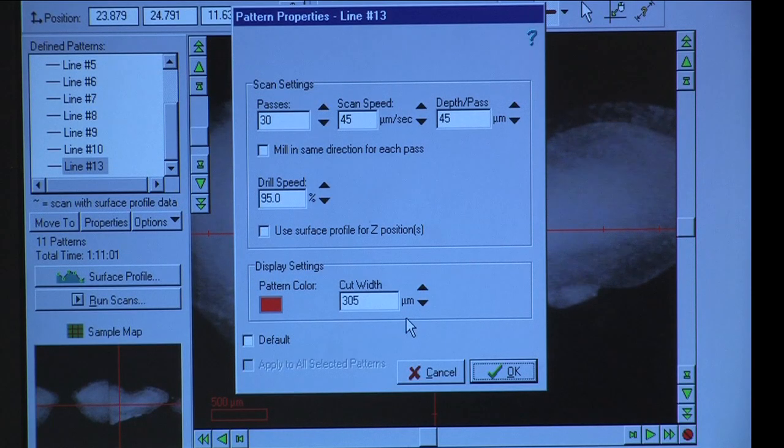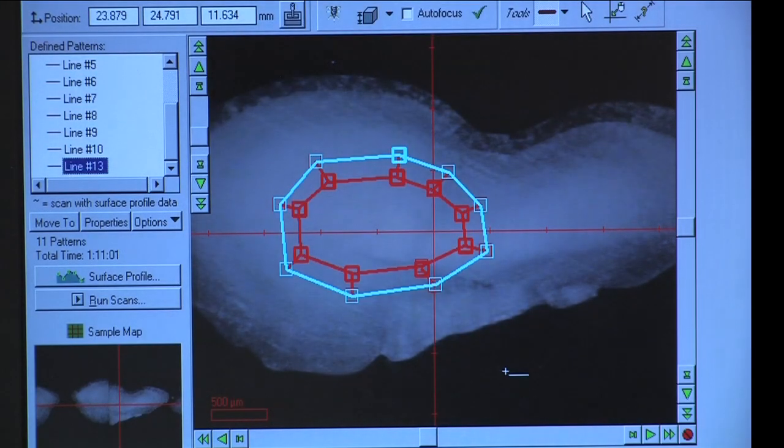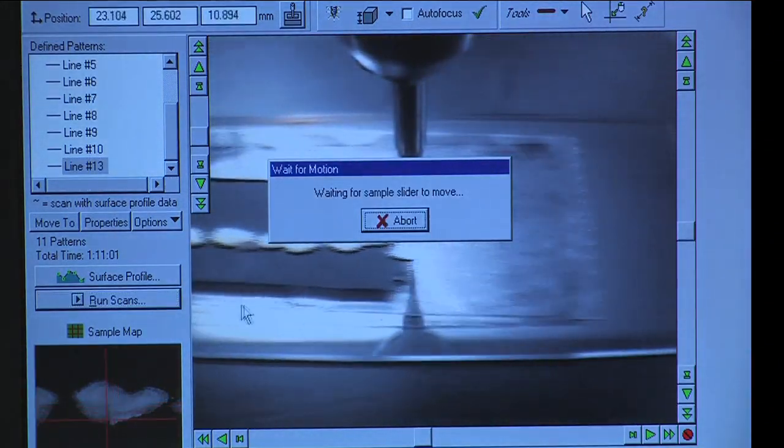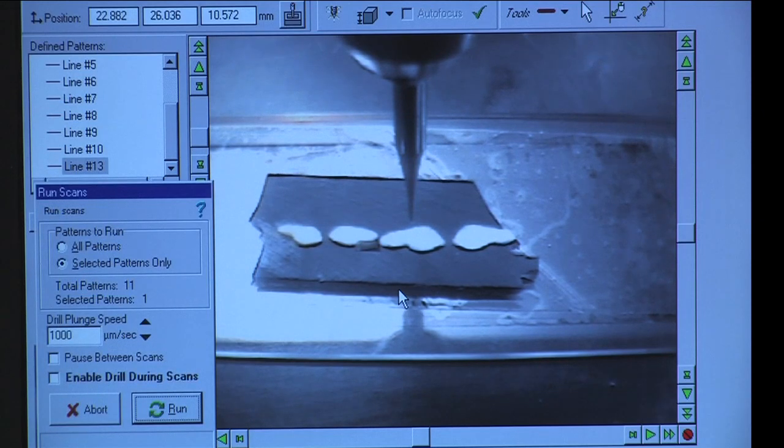When your settings are adjusted, click OK and then click on Run Scans on the left-hand side of the screen and a window will pop up. Click on Selected Patterns Only and be sure to check the Enable Drill during Scan box. Click Run and the drill will begin drilling.